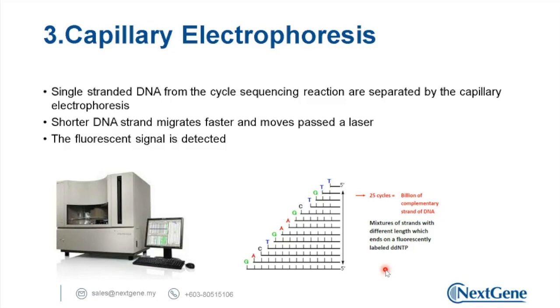However, the problem is we didn't check the sequence similarity between the one that he used for PCR and the one that we have in-house. Although the name is the same, unfortunately there are differences in their bases. And therefore, the primer binding is no good. Therefore, the cycle sequencing event failed.